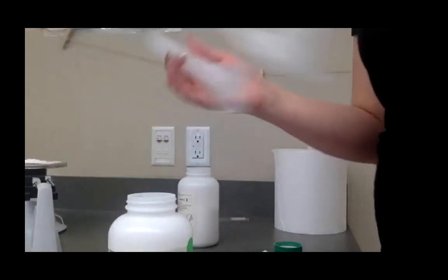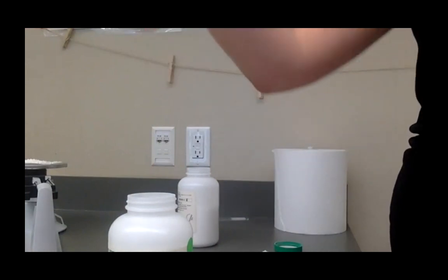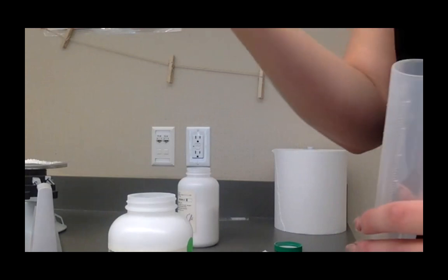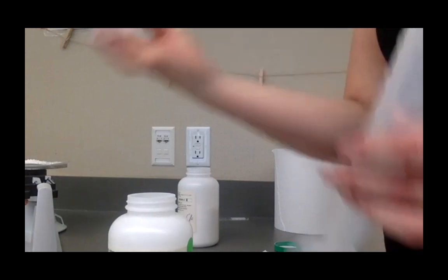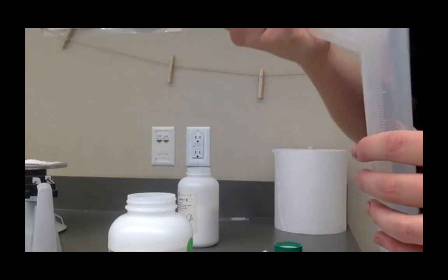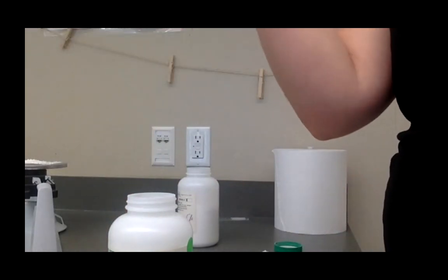And then water is going to be a little more complicated. You are going to have to measure that empty cylinder first. Fill it up with some water. I'll fill it up for you. It doesn't matter exactly how much. And then weigh it again and subtract out the mass. Right. So who wants to take on the subtraction?